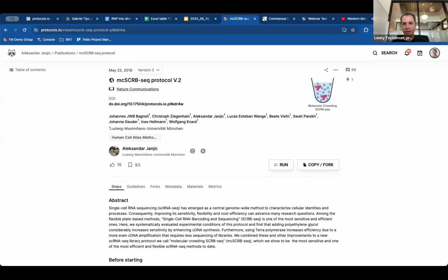Let's see if there are any open ones. I think there are some in chat. Oh, just a comment that the blind review link is clever. Kudos to the people on the team that came up with that. Thank you. I will pass it on to the team.